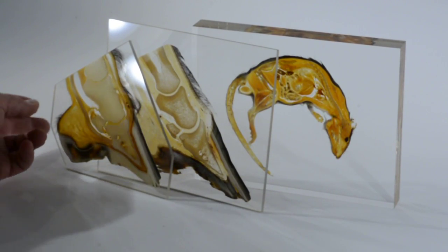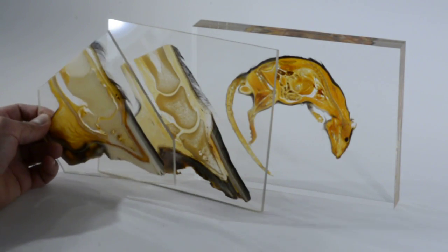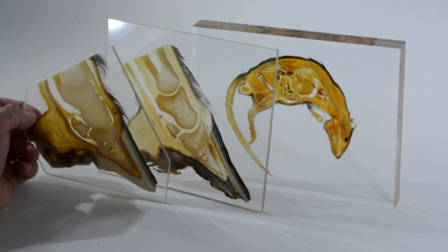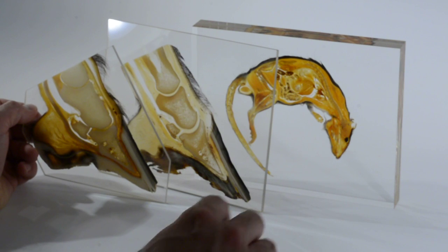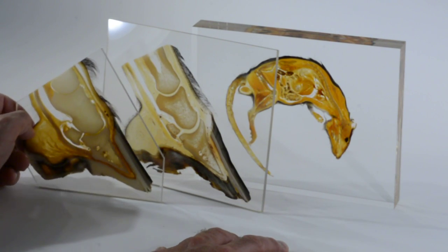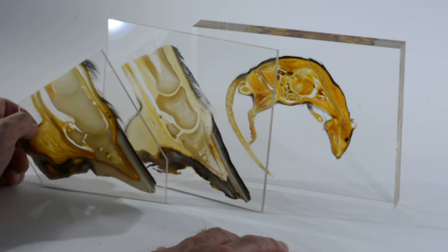Hi. Today I'm trying to answer a typical question about plastination, and this question is what are the different types of sheet plastinates, why do they exist, and what is suitable for what purpose.